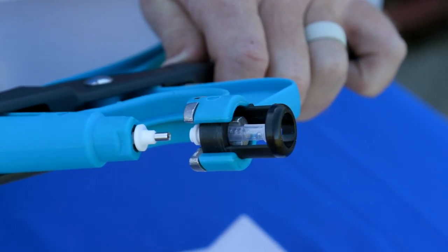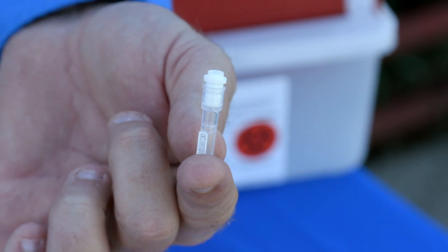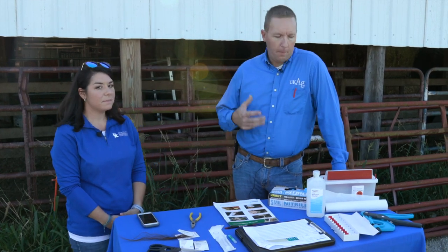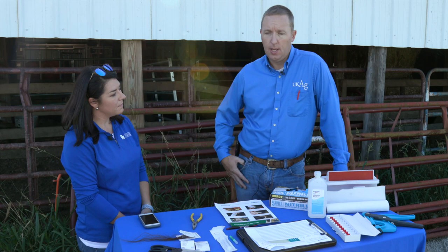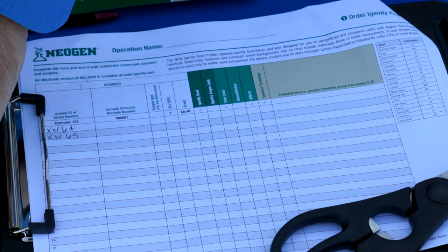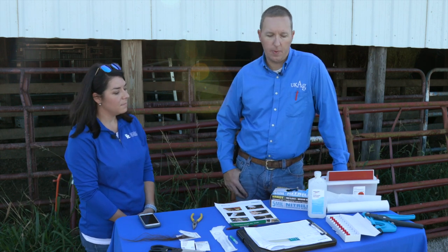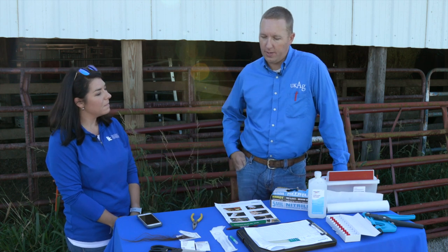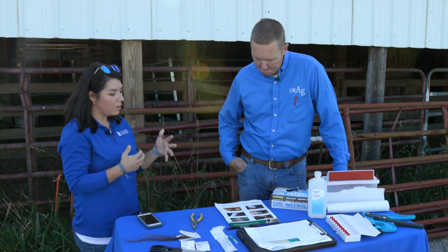There's nothing here that we couldn't do with one person, but with that said an extra set of hands certainly helps in getting samples clean and getting records correct. The record-keeping that we send alongside these samples to the lab is imperative to get the right DNA back on the right particular cow. So I like to have somebody with me wearing nitrile gloves, doing things clean with good handwriting, filling out those sample cards as we take those samples and move forward.